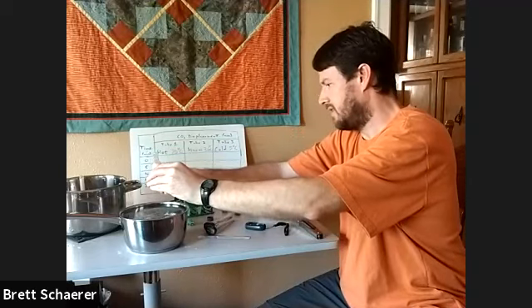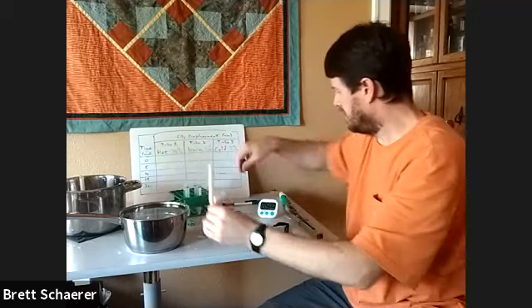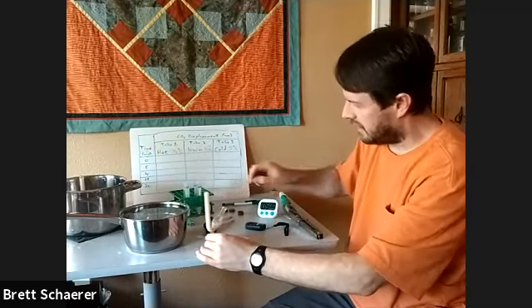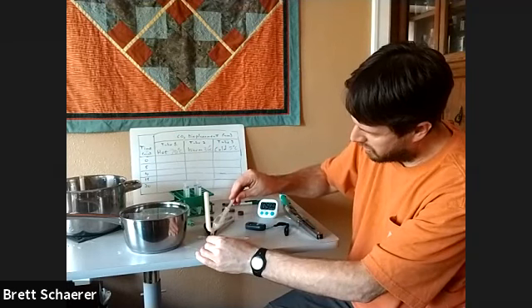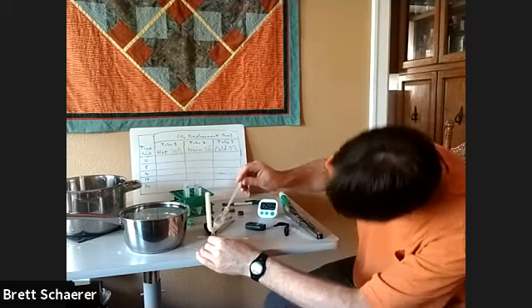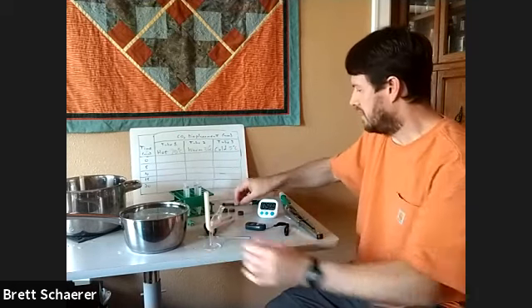Again, get the yeast into the mixture, I should say, into the tail. And then add an air bubble. And mark it.